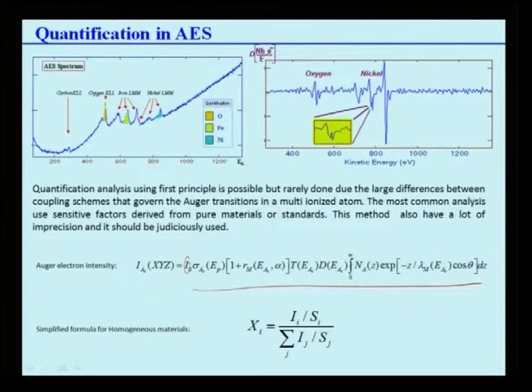This is the incident beam intensity, this is the cross section, this is the energy level, this is the diameter from which it is coming, which is also a function of energy level and the incident beam angle. This is the atomic number of atoms which has undergone transitions, the exponential, the transition wavelengths, and cos theta is scattering. This is a very complex formula and I do not want to discuss it in detail because that requires a lot of theory to be discussed first.